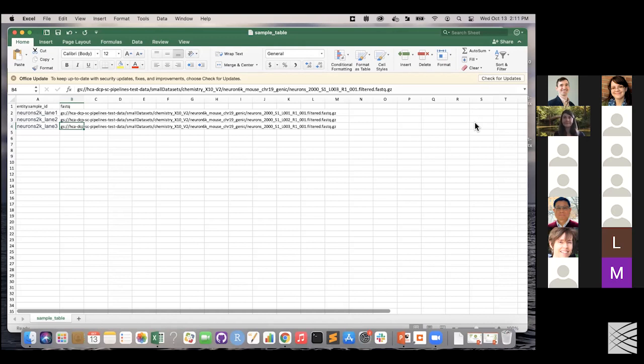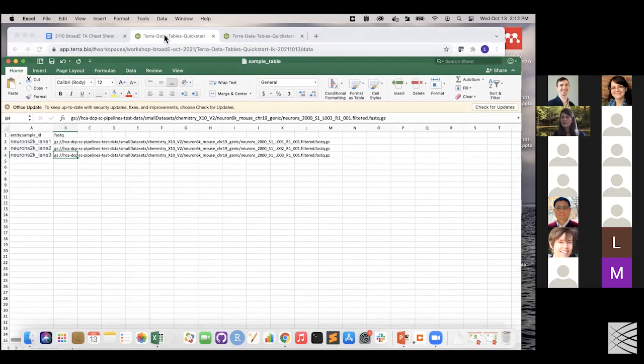Liz, there's a question from Jean that says, several steps ago in the status column, it reads, failed for workflow statuses. I believe I followed your exact instructions. Might this be a billing account failure? I don't know if it's a billing account failure, but let me just go back really fast. Probably not a billing account failure if they copied the workspace. Right, the billing account failure would prevent them from copying the workspace. So it's probably not related to that.